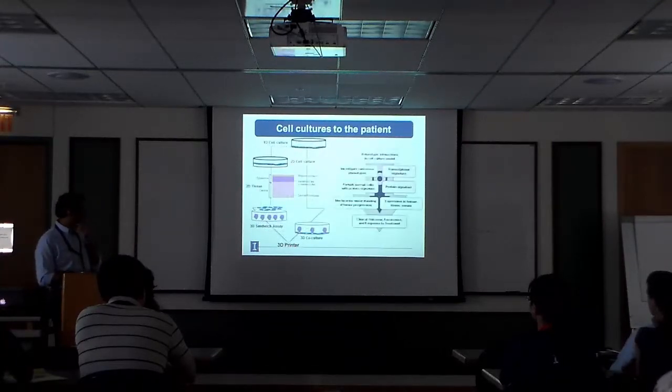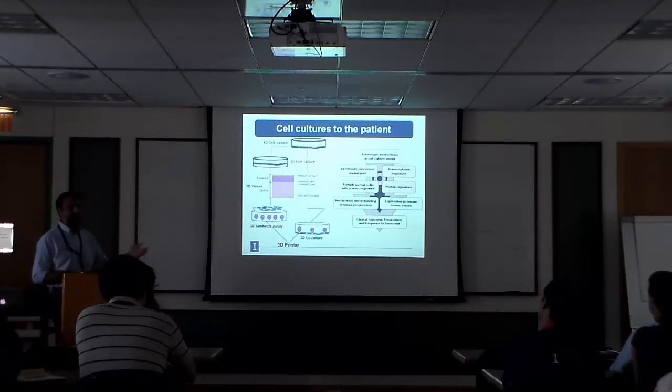So the way we do this, let me quickly explain, is we started many years ago doing cell culture of single cells laid down on a line of fibronectin, right? Then we went to 2D cultures. We started culturing skin in our lab many years ago, but this is commercially available, so we just wanted to meet the skin model people.